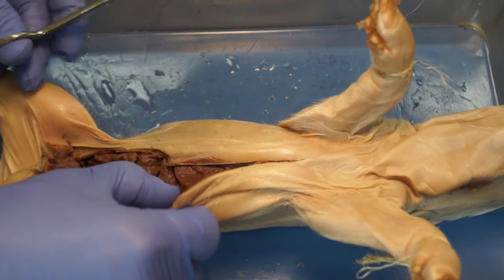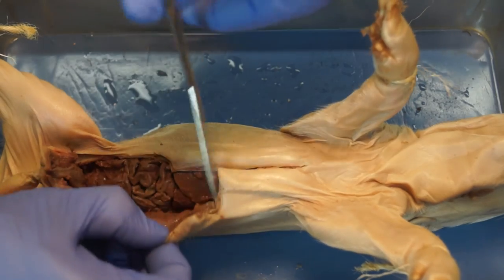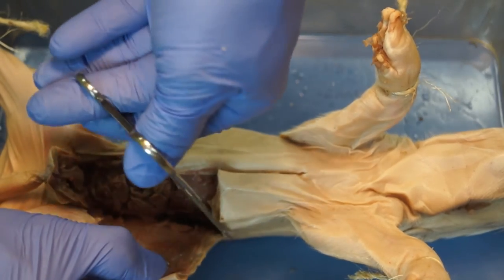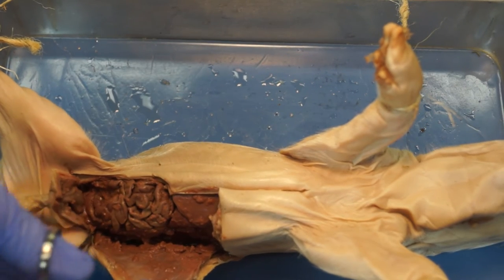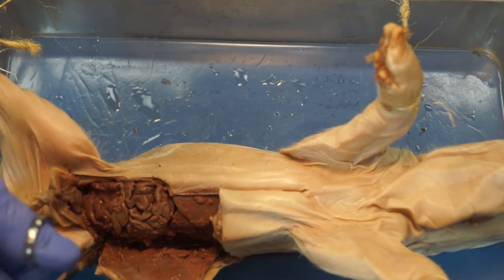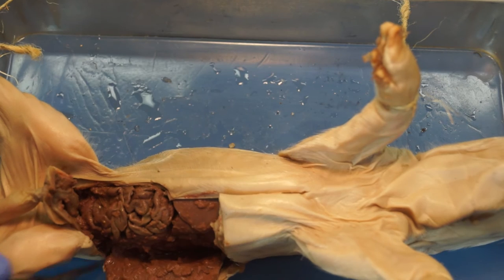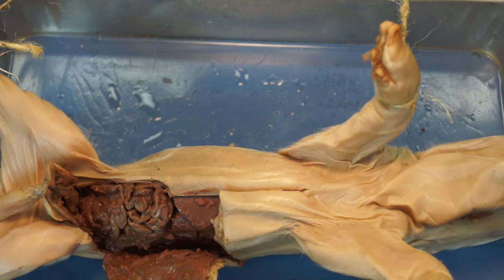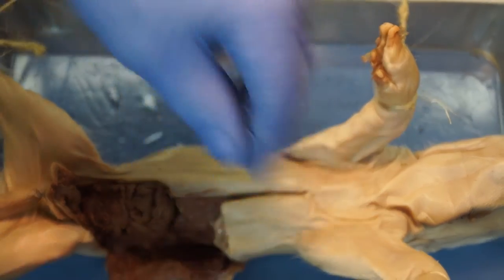Cut number three: cut along the side so we can open up the side of the abdominal cavity and have a flap, so we can actually access all of the things inside the cavity. It may be a little challenging, but take your time carefully. As you do that, if you'd like, you can take a pin or two and pin back the sides so they're out of your way.